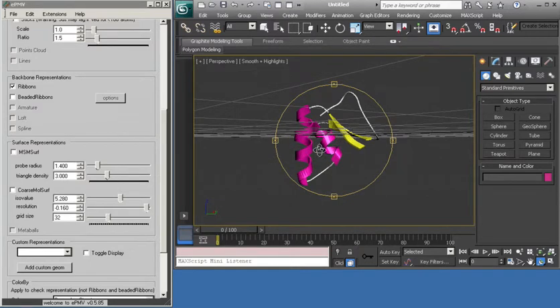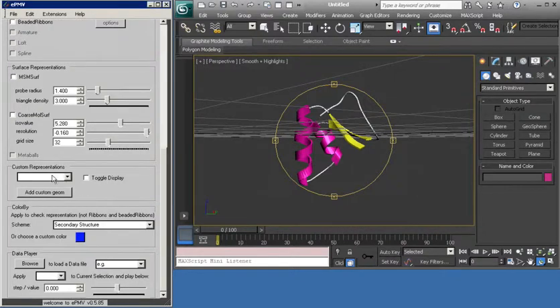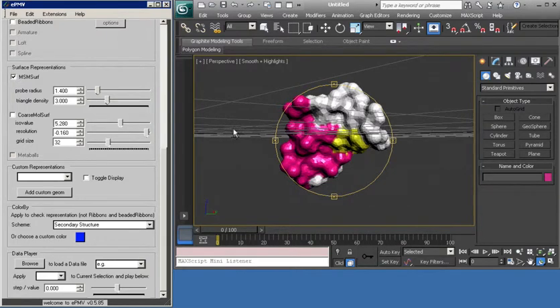So these default coloring schemes are pink and yellow for our particular viewer here. And you can see that the atoms that are sticking out with their large side chains from this surface, from this backbone, are color-coded to match it. So if we turn MSMS back on, you see the pink region is pink, the white is white, the yellow is the yellow.